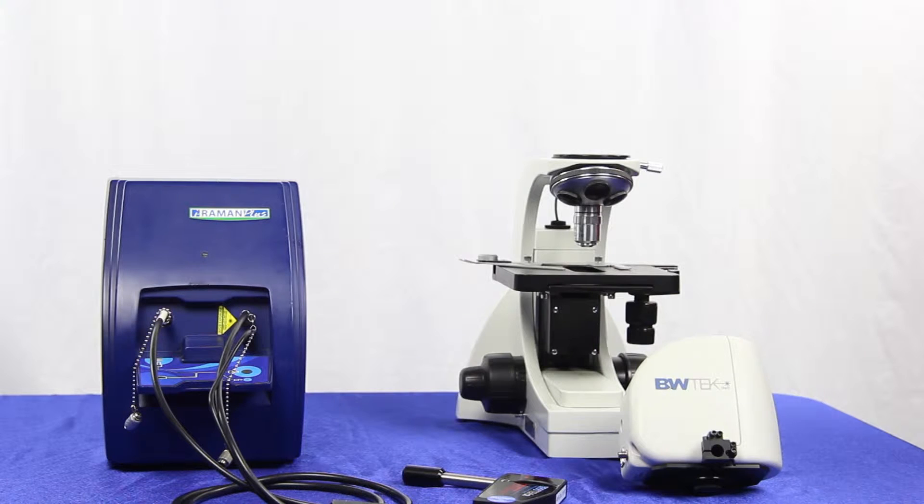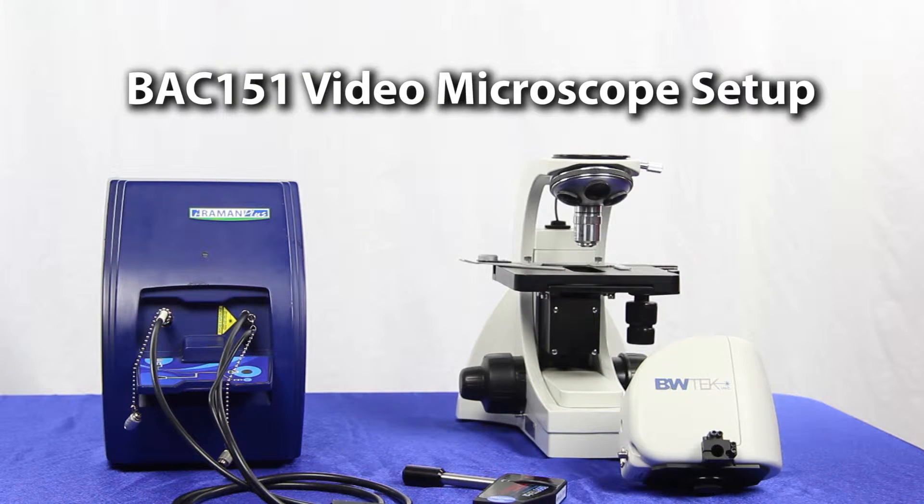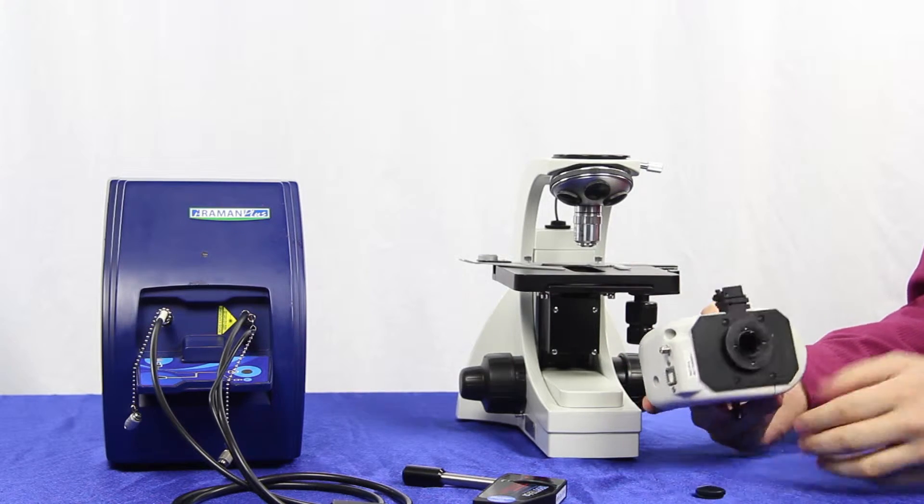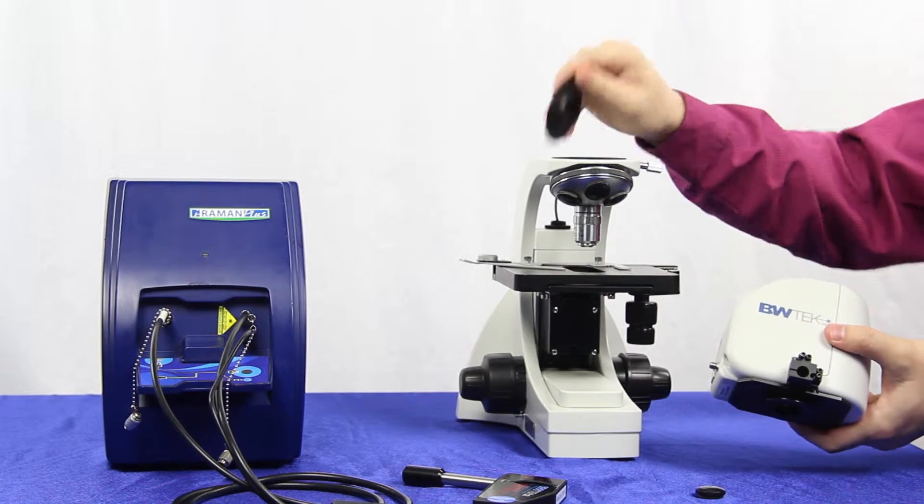Today we're going to show you how to set up a BAC-151 microscope with a portable Raman system. First of all, you'll want to make sure that you've taken off all of the protective coverings.